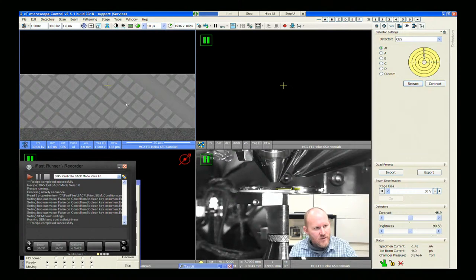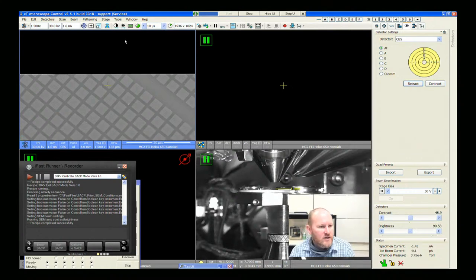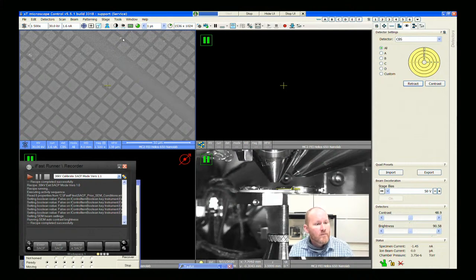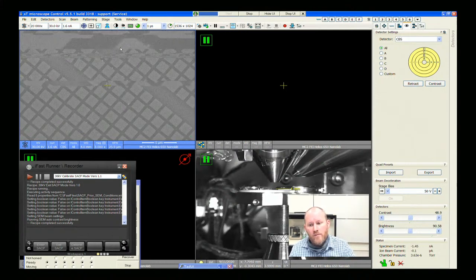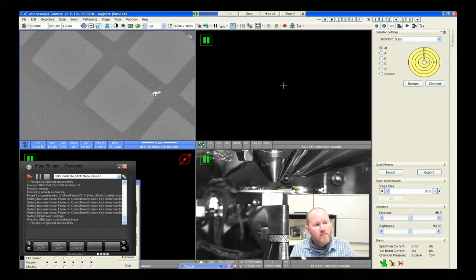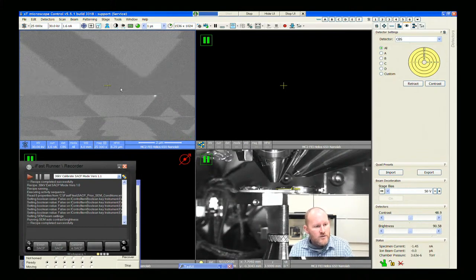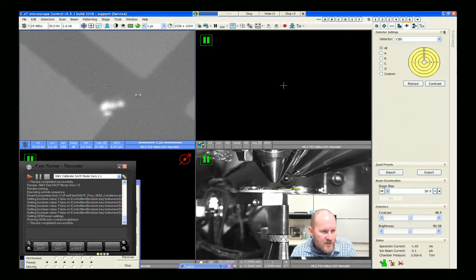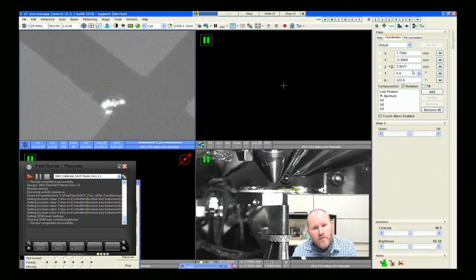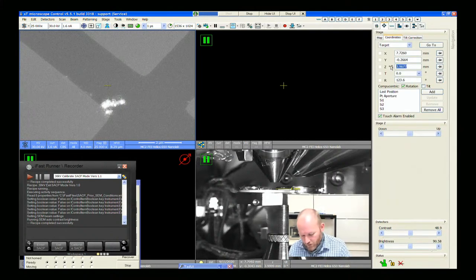We have much more signal with the backscatter detector than the secondary electron detector, and that's just not normal. I just want to verify we're at four millimeter, because that's where we set our rocking point. We're 40 microns off, so that's fine.